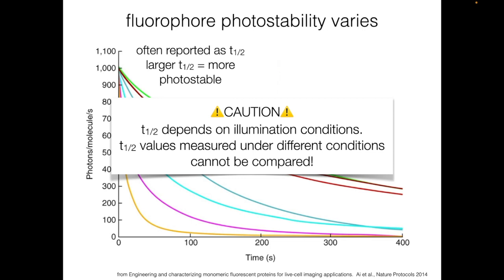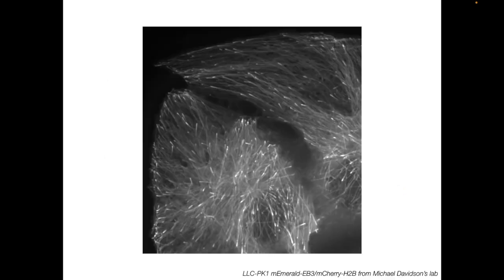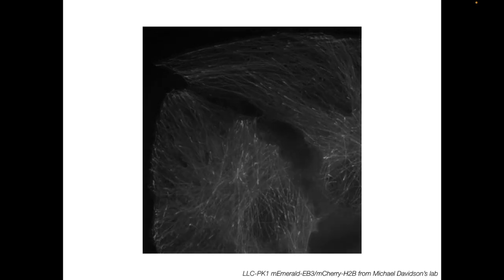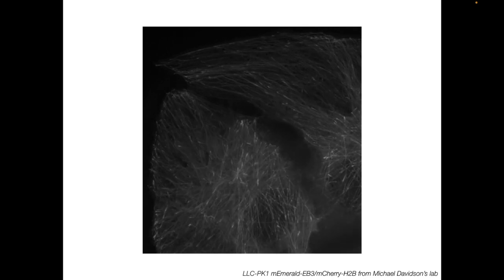Fortunately, what we care about most of the time isn't the absolute photostability of a fluorescent protein, but rather how it performs under the specific experimental conditions we will be using. The best way to determine whether a fluorophore is photostable enough for your experiment is to test it yourself. Returning to our photobleaching example: this is a time-lapse experiment where I've collected one image every second for about two minutes. By the end of the time lapse, the image is too dim to use and I can no longer detect the structures I'm interested in — so I'm limited in how many frames I can use.